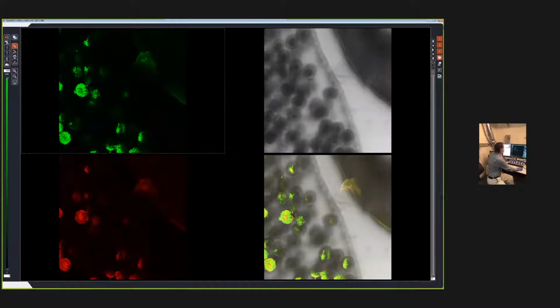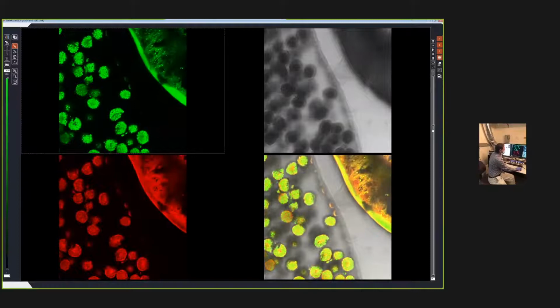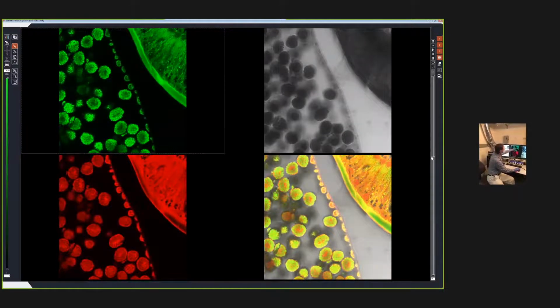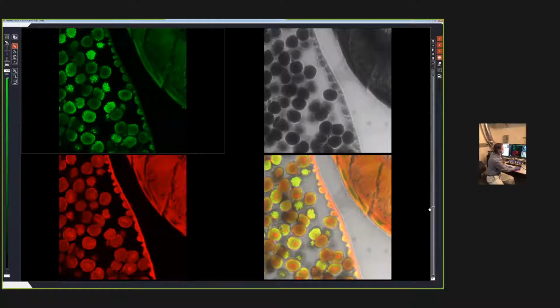As I move down the Z-stack, unlike our previous transmission image, which you'll still see there in gray, we only see one slice at a time. You can see fine details, especially in the green, this fiber network right in the middle of this dense patch that we would never be able to identify, or these hollow cavities that don't show up in either color that also help us figure out the three-dimensional makeup.